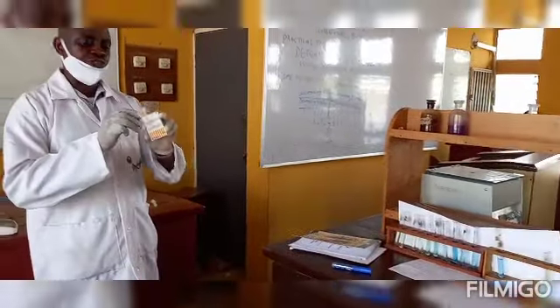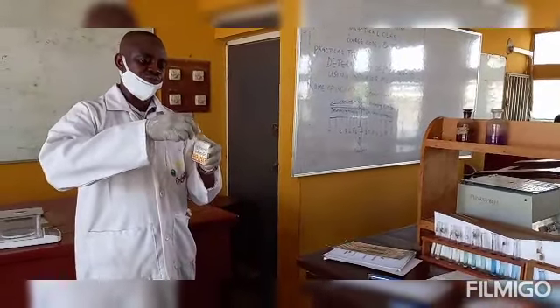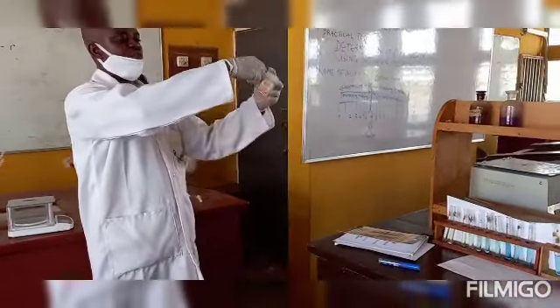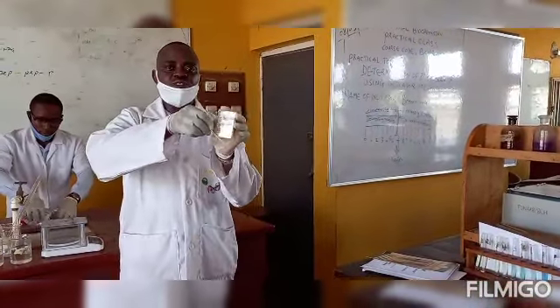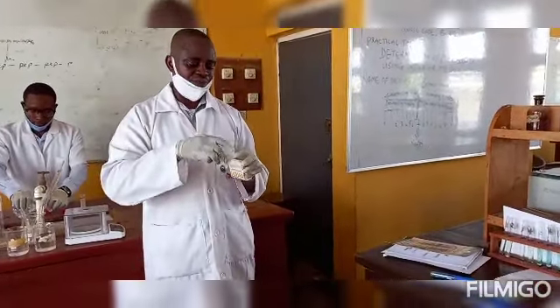After taking out the strip and you dip it inside the test solution, a particular color will develop here, then you match the color with the one on the cartridge. Whichever one the color tallies with is taken as the pH of that color code. So it's the same thing as color matching.